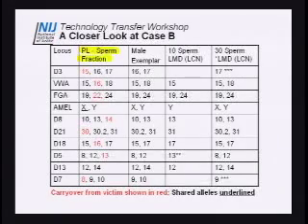So the original results are here. Pretty clear mixture. The ones highlighted in red are carryover from the female fraction. I put the male exemplars there so you can look at that. And unlike the first chart, I actually added another column here.